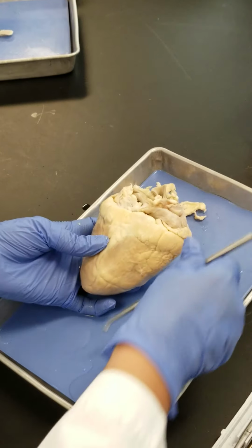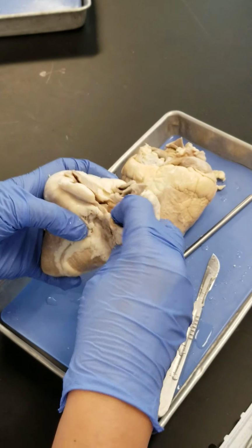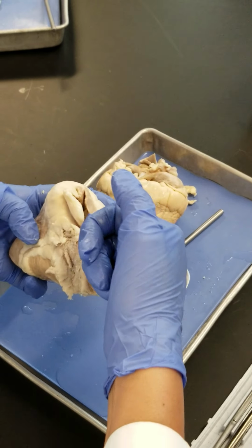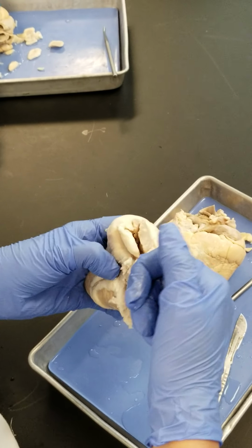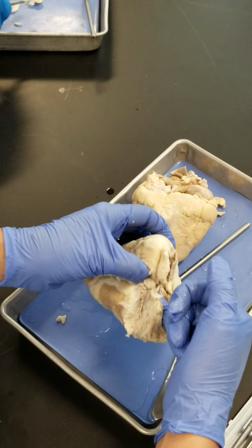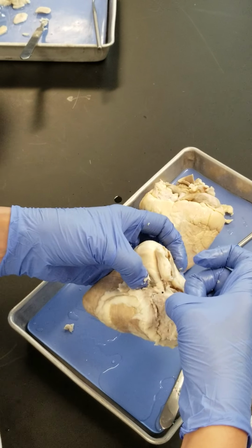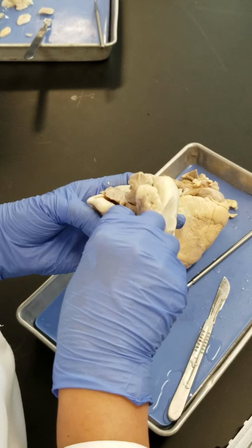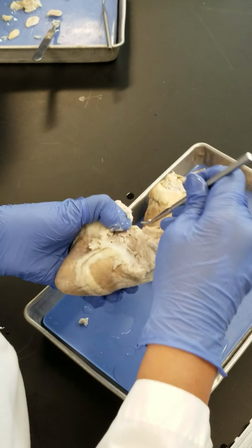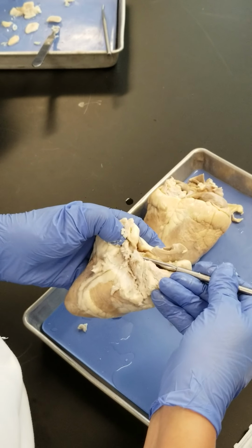We're just having a hard time finding it. Give it to me. So you found the right atrium, right? Put your finger inside and try to find it. Do you see this one? Here you go.